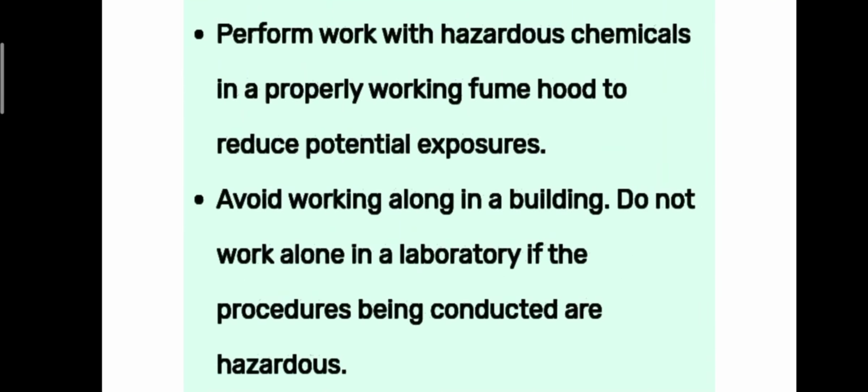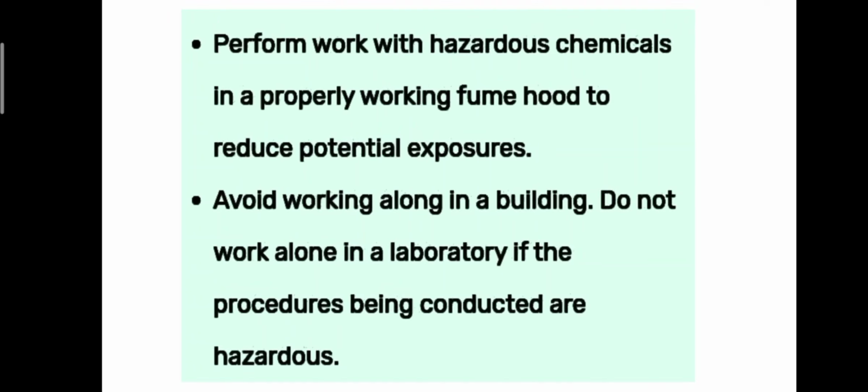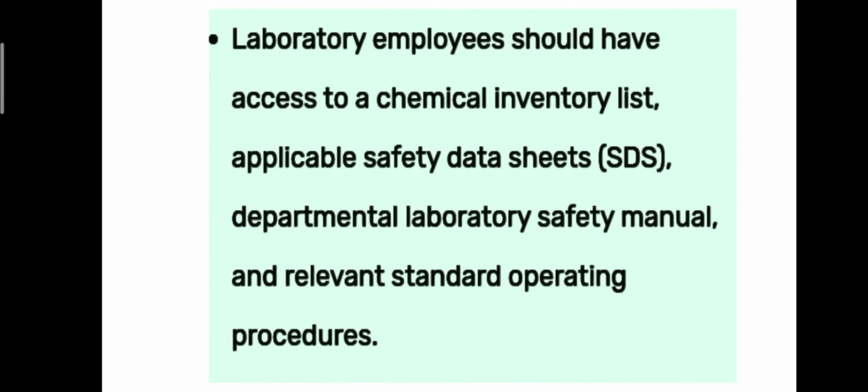Perform work with hazardous chemicals in a properly working fume hood to reduce potential exposures. Avoid working alone in a building. Do not work alone in a laboratory if the procedures being conducted are hazardous. Laboratory employees should have access to a chemical inventory list, applicable safety data sheets, departmental laboratory safety manual, and relevant standard operating procedures.